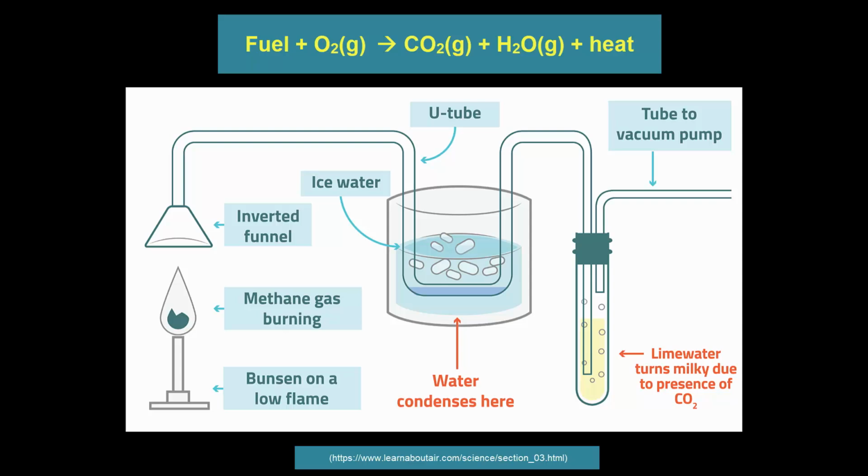detect the water, and we're not going to use lime water in this case because I was repeating this a few times, and it's much easier to reset it with an acid-base indicator rather than a precipitation reaction, which is what happens when carbon dioxide goes through lime water. It goes milky from a precipitation. Carbon dioxide mixing with water forms an acid, and we can just use an indicator that changes color when the pH changes.